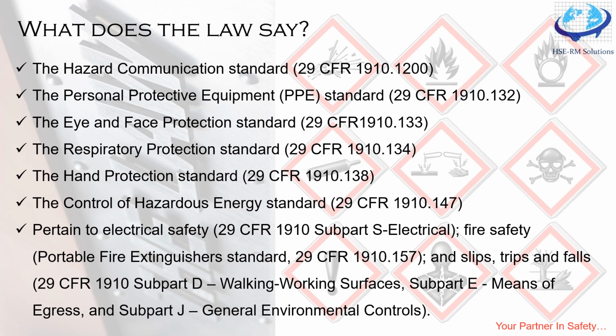So like we said, with 5 simple steps of communication, if it is improved to a level, the overall safety culture and the acceptance of PPE comes. So that is where we actually need to work. Now, one of the most important standards we miss is the control of hazardous energy standard, that is 29 CFR 1910.147. Now, most people don't refer to this standard, but it's very important to understand hazardous energies during a process, accidental release or hidden energies, and from where a sudden release can happen.